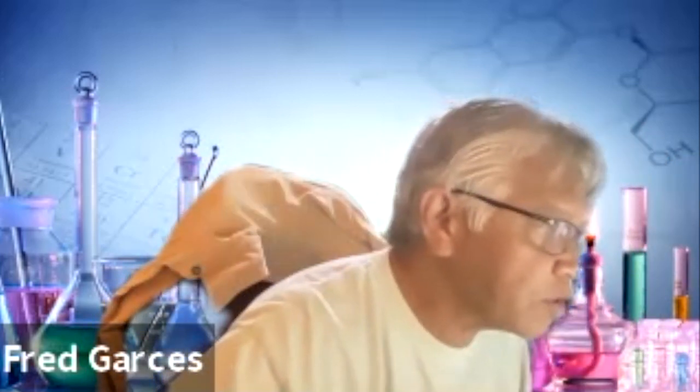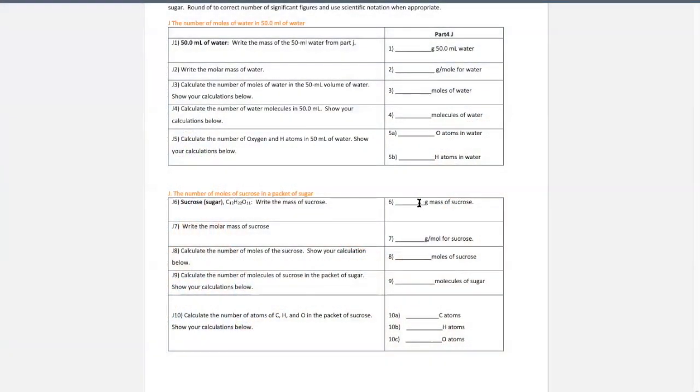So whatever mass you weigh out, which is what you would put right here. Okay. And then look up the mass of sucrose or calculate it. 12 times 12.01, 22 times 1.01, 11 times 16. That would be the molar mass. Why do you need that? Because again, in order to convert grams of sucrose to moles of sucrose, you need the molar mass. So you need to put that right here.